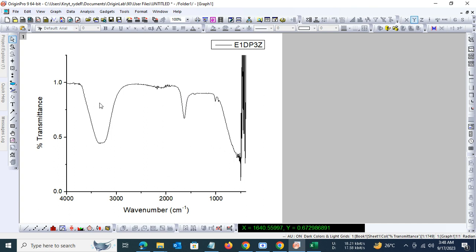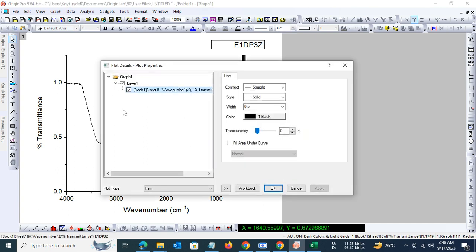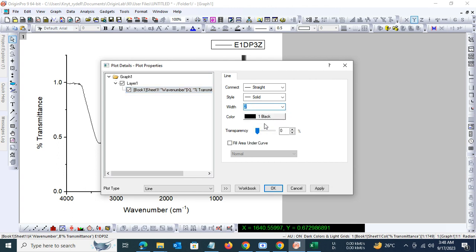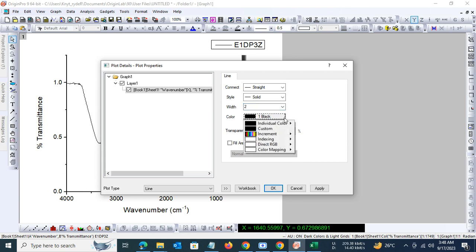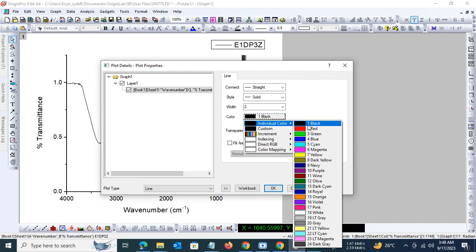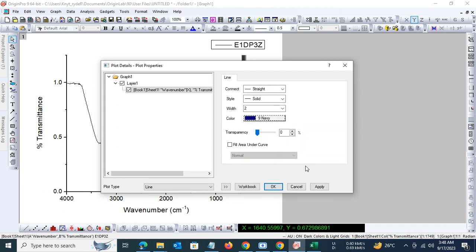So that's it. You can also define the width of the line in the Origin spectra, and even the color can be defined as per your choice. Let's keep it navy blue. Apply and then okay. So there we have our IR data.